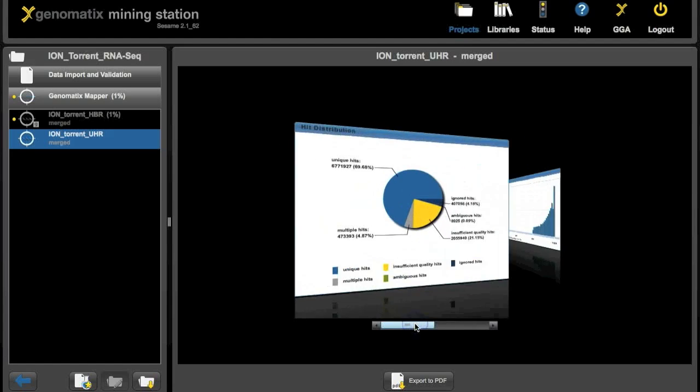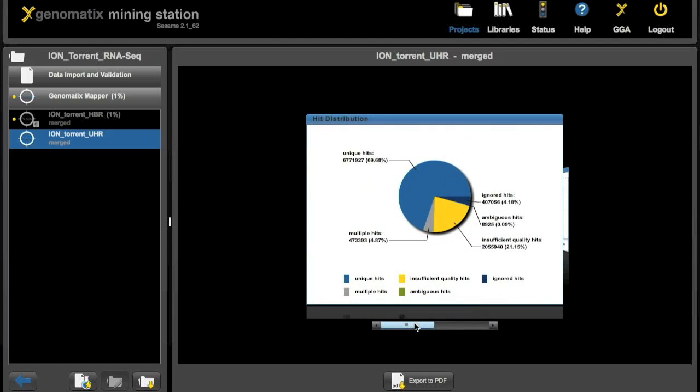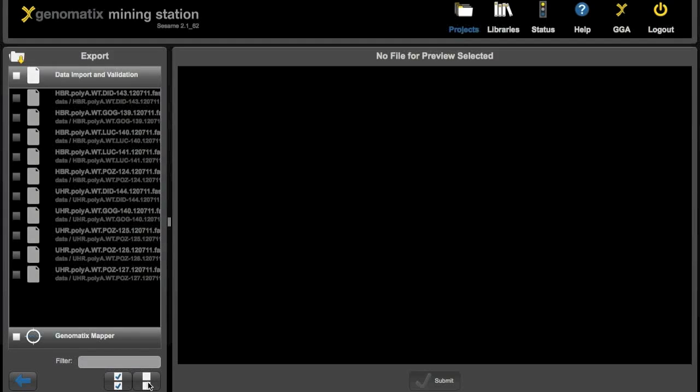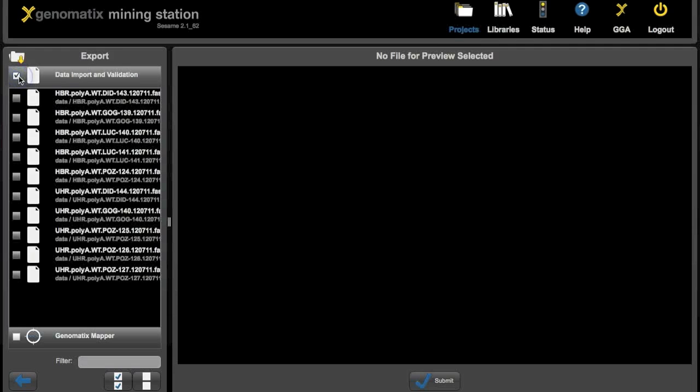And now that the analysis is finished, what we can do for example is we can export files from the project. Click the export project button down here and you can export any file that's contained in the project.